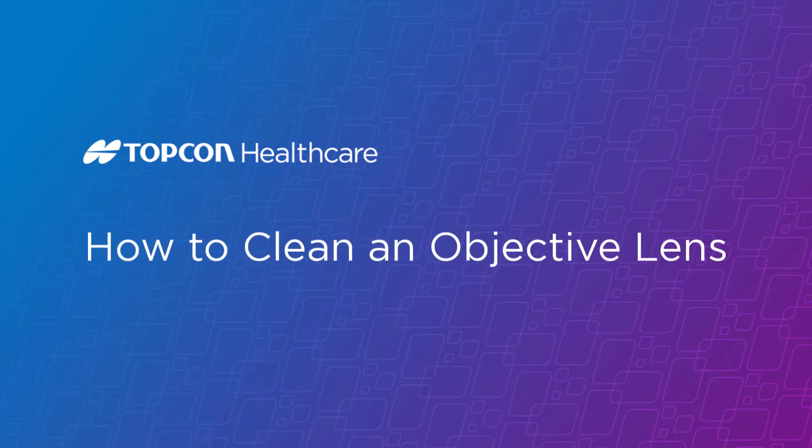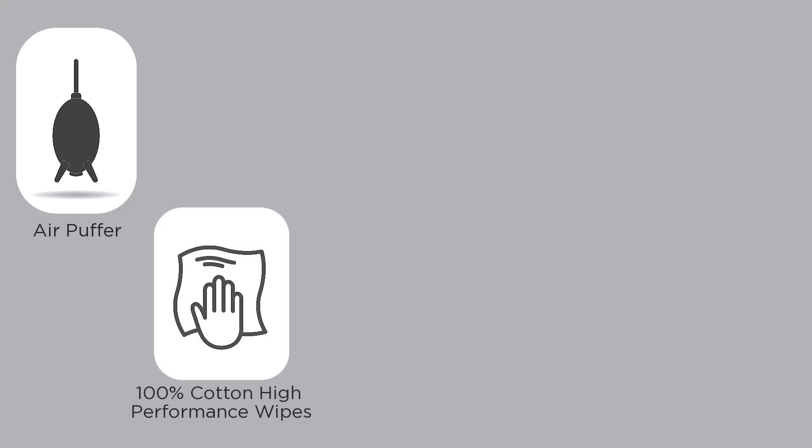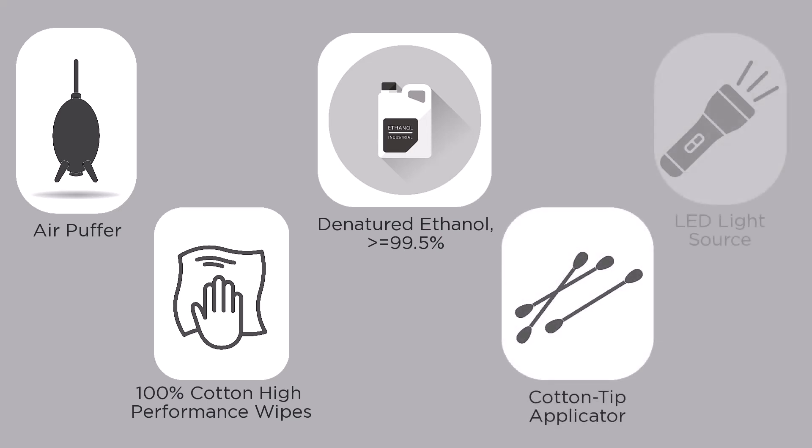How to Clean an Objective Lens. The items you will need in order to clean an objective lens are an air puffer, 100% cotton high-performance wipes, denatured ethanol greater than or equal to 99.5%, a long cotton tip applicator, and an LED light source.